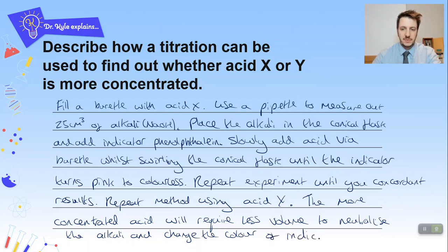Lovely stuff. Okay, now you could maybe put in a little bit of information there as well if you wanted to. You could use M equals C times V. So then you would rearrange that as C equals M over V, and you could figure out the actual concentration if you've actually got some numerical data for this as well.